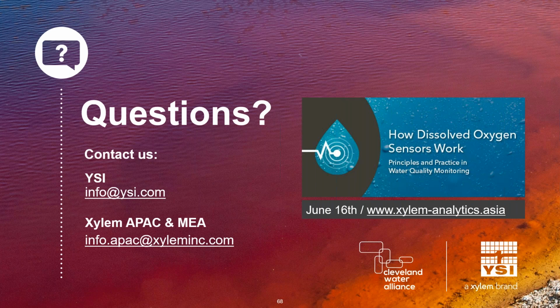Terrific, thank you. Is it possible to calibrate randomly, for example, 7, 4, 10, or 4, 7, and 10? What is the right sequence here?